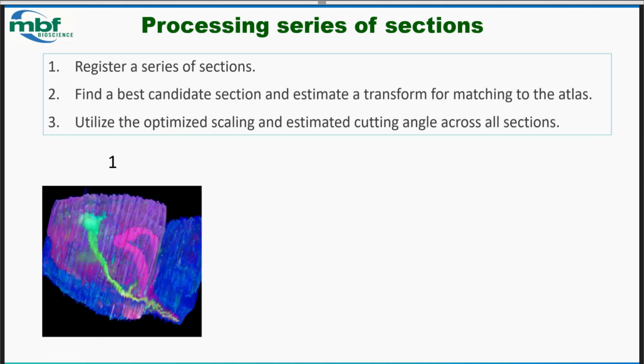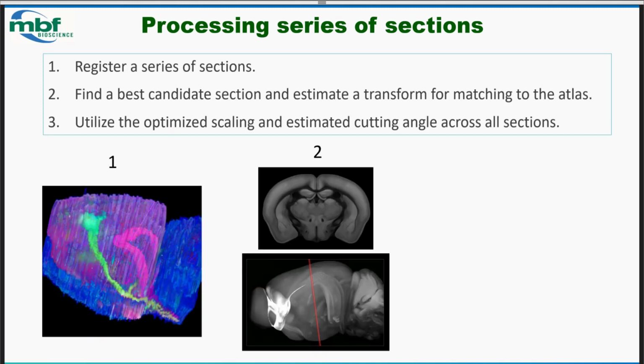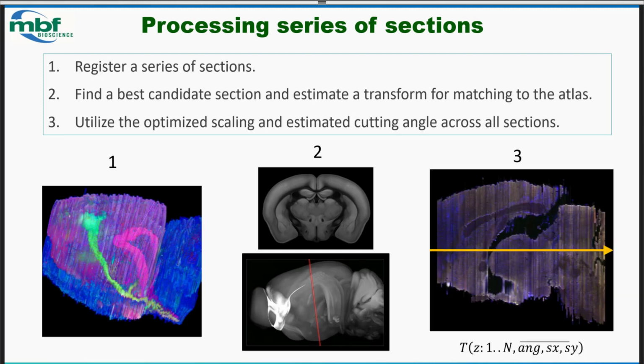To really drive home what the process is, we start here today. We're going to start when we already have that aligned brain volume from serial sections, compiled out of BrainMaker, which is inside of NeuroInfo. What we do is take a representative section from that brain volume that has a lot of landmarks that we can use to semi-automatically find a good fit equivalent section in the Allen average mouse brain, and that's part 2 here.